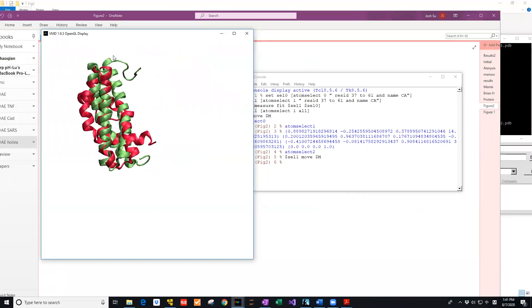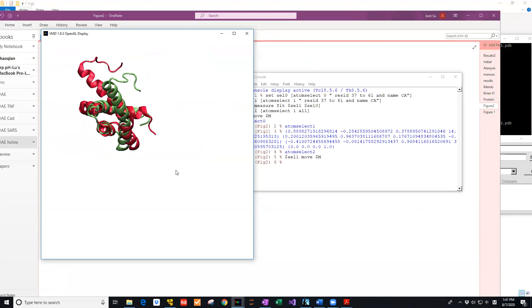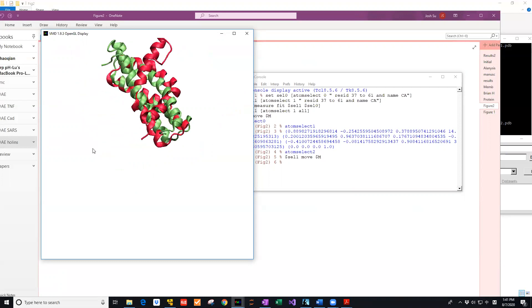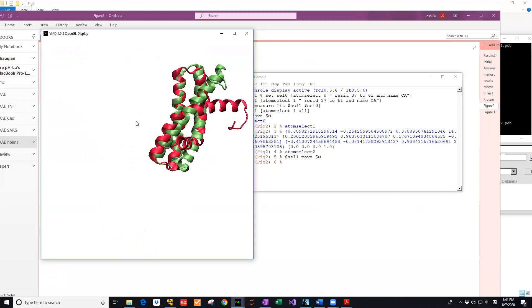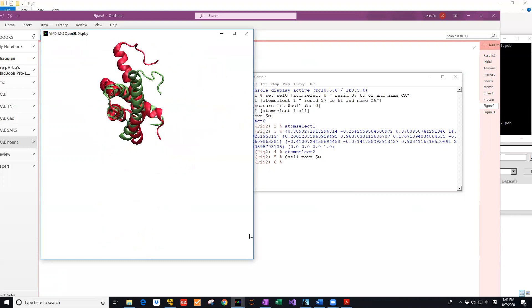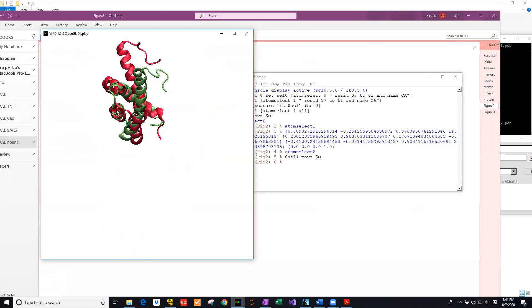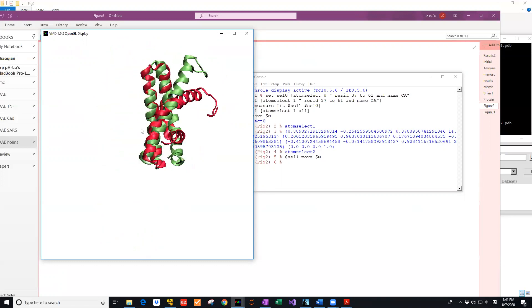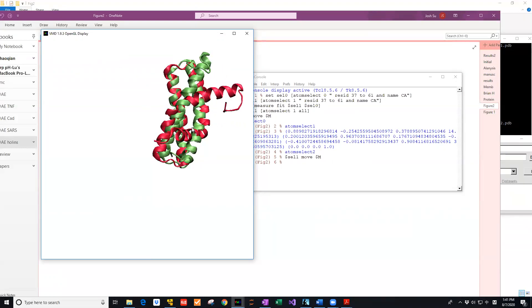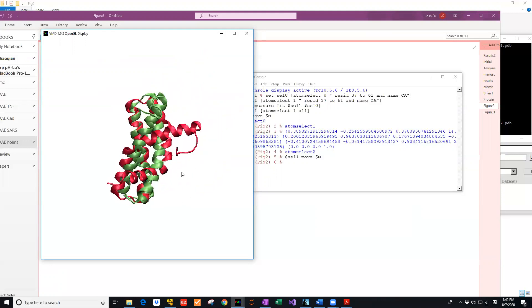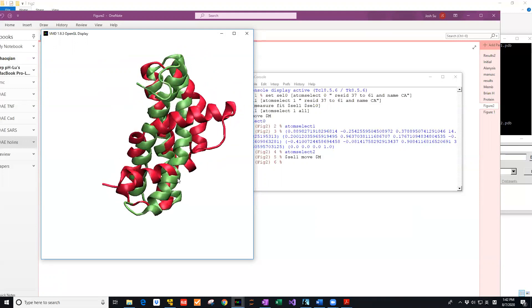You can see helix-1, helix-2, and helix-3. The helix-2 is aligned together very well, but helix-1 and helix-3 are different. So right now the next step is to take a picture.